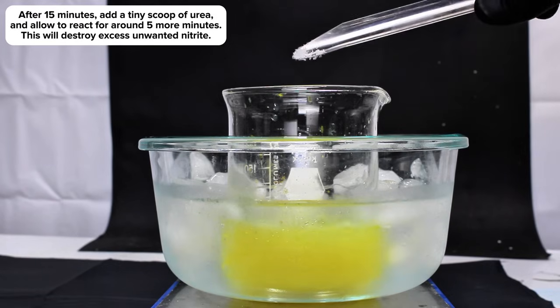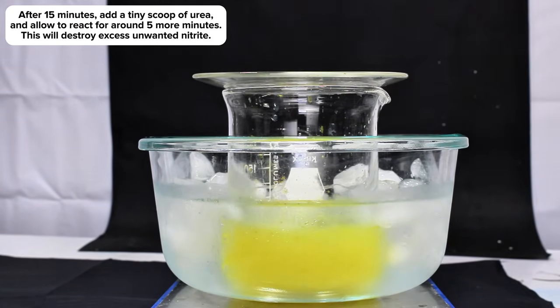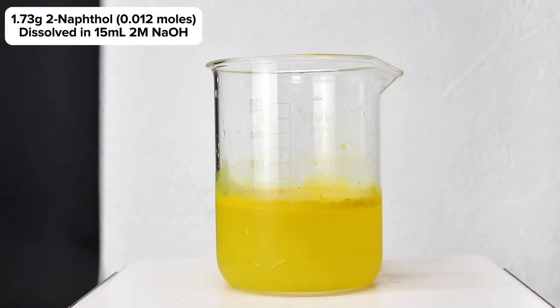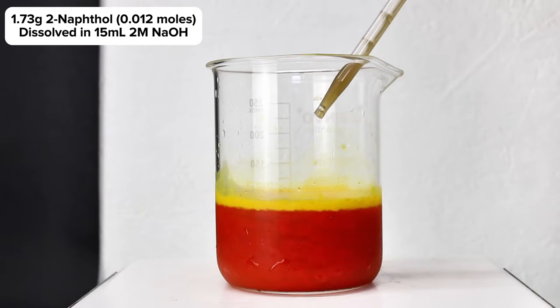Once the mixture had about 15 minutes to sit and react, I went ahead and added around a quarter gram of urea to destroy any excess nitrite. This was allowed to react for another 5 minutes before slowly adding 1.73 grams of 2-naphthol dissolved in 15 milliliters of 2 molar sodium hydroxide, which will immediately react forming a dense red precipitate of para-red.